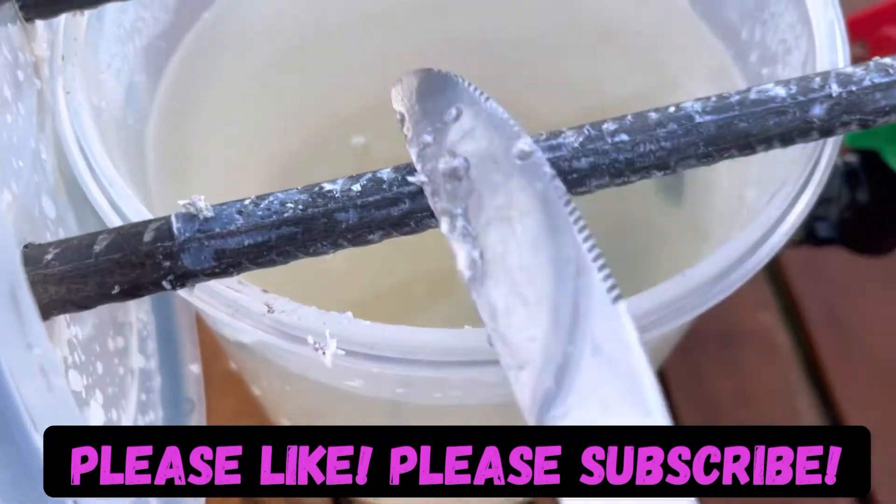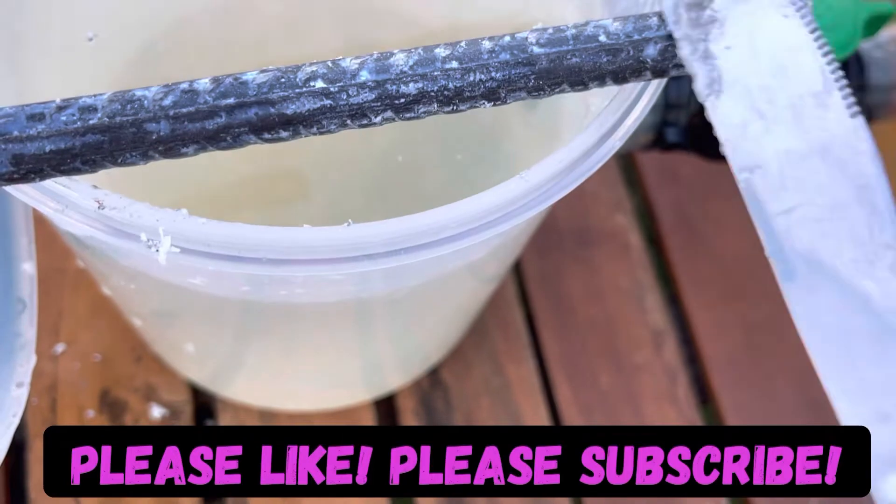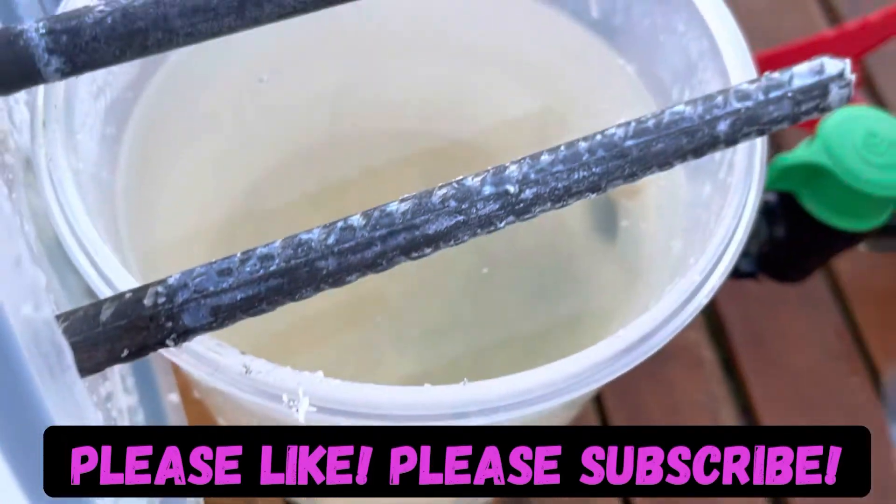There's this one that I've just cleaned up by rubbing all the white material off it. It exposes the iron beneath to give it better contact.